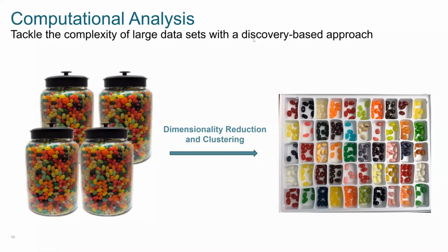Okay? This is an oversimplified view of what these tools can do for you, but it's just an example of what would be the end product from something like a large single cell RNA-seq experiment where you have thousands of cells with maybe hundreds of different transcripts, and how you can get to an endpoint of something like this that's a little bit more digestible.